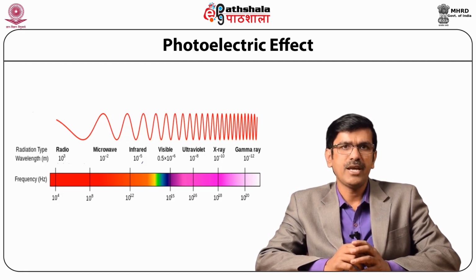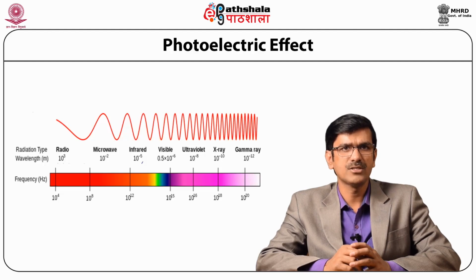The distinction between X-rays and gamma rays is partly based on sources. The photons generated from nuclear decay or other nuclear and subnuclear particle processes are always termed gamma rays, whereas X-rays are generated by electronic transitions involving highly energetic inner atomic electrons. In general, nuclear transitions are much more energetic than electronic transitions. So, gamma rays are more energetic than X-rays.